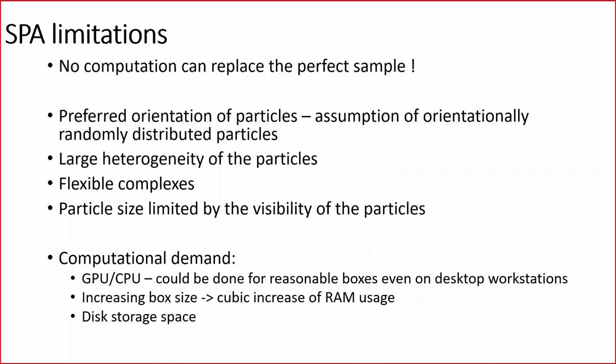Now, I haven't covered everything from SPA because there are many other techniques that are very useful and interesting, like localized reconstruction, and modern methods for correcting the images such as CTF refinement, third-order and fourth-order aberration correction. These are out of the scope of this lecture. They will be covered in the advanced cryo-electron microscopy methods, so you are very welcome to follow in the next semester on these lectures.